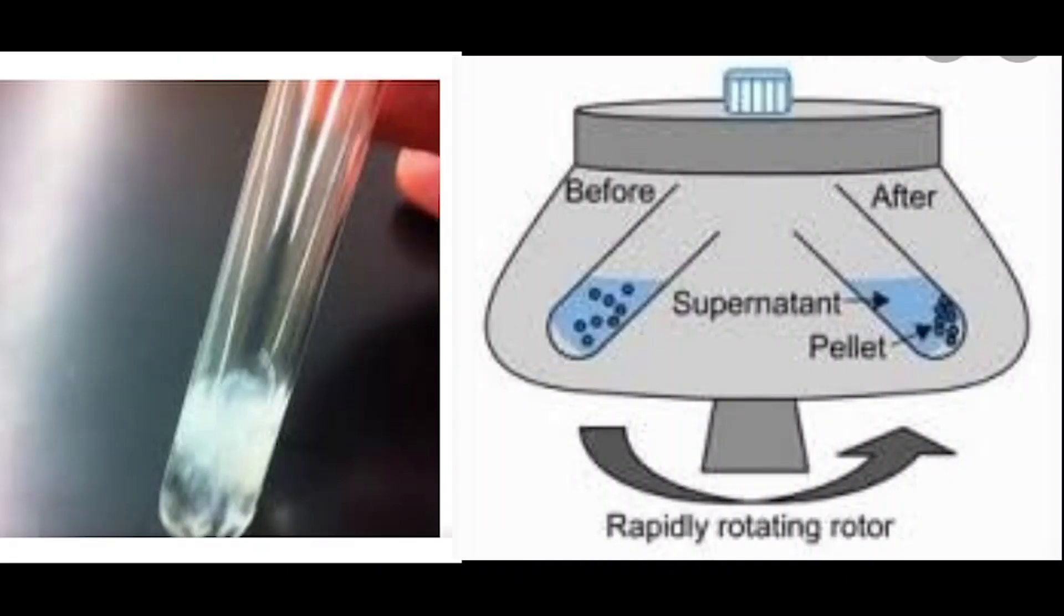We used chilled ethanol to separate out the DNA molecule from the other digested macromolecules. We want only the DNA in its pure form. You can see this DNA precipitate at the interface. We load it in a microfuge vial and subject it to a process called centrifugation. At high RPM, this DNA will precipitate down and stick to the bottom of the vial. All the other digested macromolecules will remain in the upper part called supernatant. You discard the supernatant.